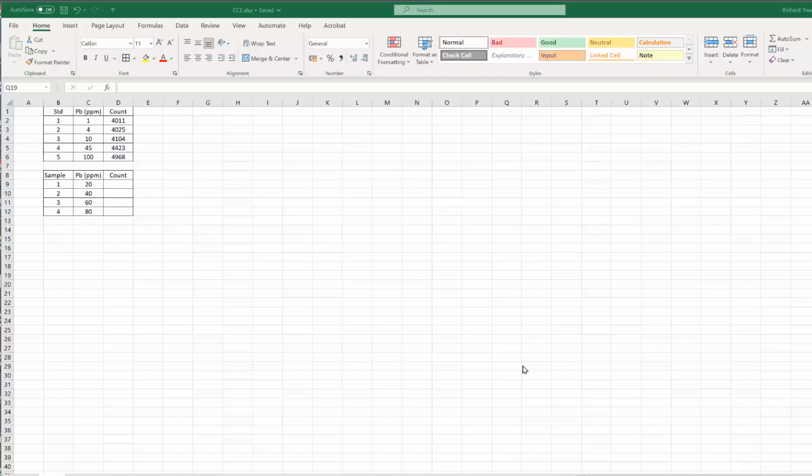This is ULAS exercise 2. First, to plot the data. So these are the XY coordinates, so it's just these two columns. We've got on the x-axis lead measured in ppm. These are measurement standards, and then calibration is according to the count, which is in the second highlighted column there.